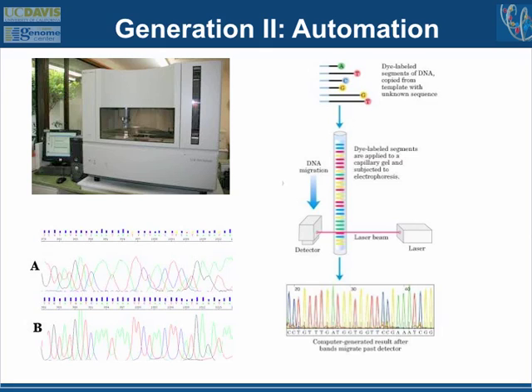So you separate the DNA by size, and you read at a particular set point the color that is coming through the capillary. And then you get a little plot, an electropherogram, that tells you what the sequence is. So this was completely revolutionary. It allowed people to massively scale up DNA sequencing. And this is what led to the genomics revolution.